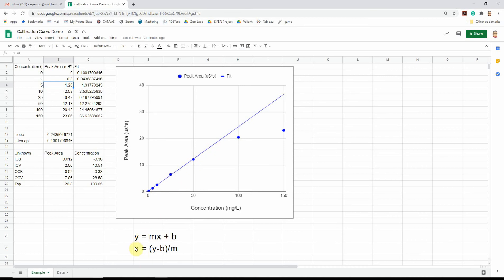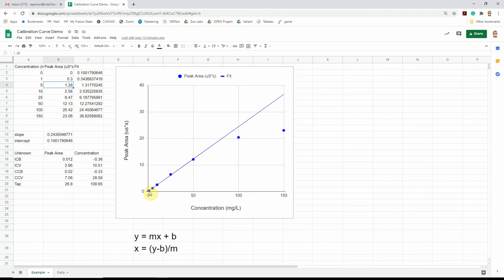So each line can be described as the y value is a slope, m, essentially how steep the line is times the x data plus an intercept or where that best fit line crosses the y-axis. Once we have that equation, so there's my slope and intercept in this spreadsheet.